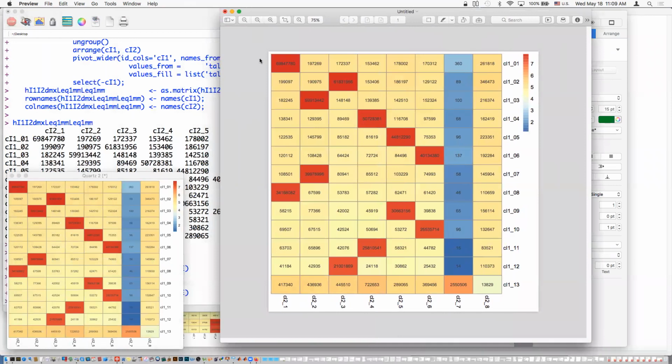Okay. So the numbers you see are literally the entries of the matrix. The row and column names are around the edges there. The color bar for log 10 representation is on the right there. So the bottom is basically 1, 10 reads, and the top is almost 8, which is 100 million, right? And then the color in the square is just a conversion of the number to color just to visualize it.